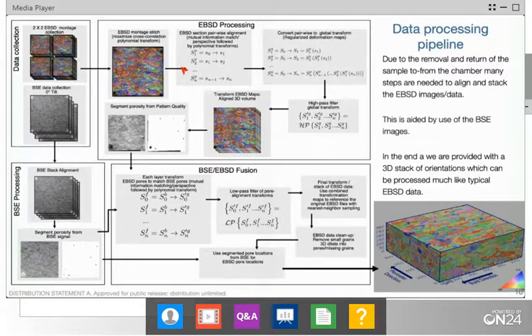It was found that here we needed to use a fairly complex set of transforms in order to get things to line up. It's a combination of perspective transforms along with a second degree polynomial or quadratic function that gives us enough freedom of how to warp these images in order to get them to line up and get good matching from section to section.